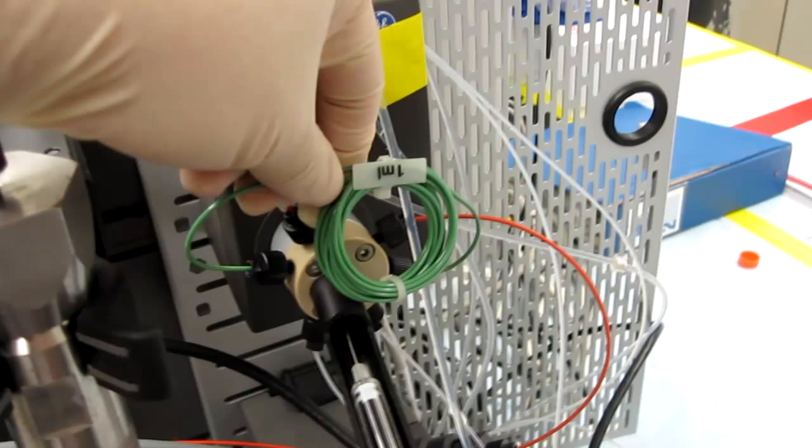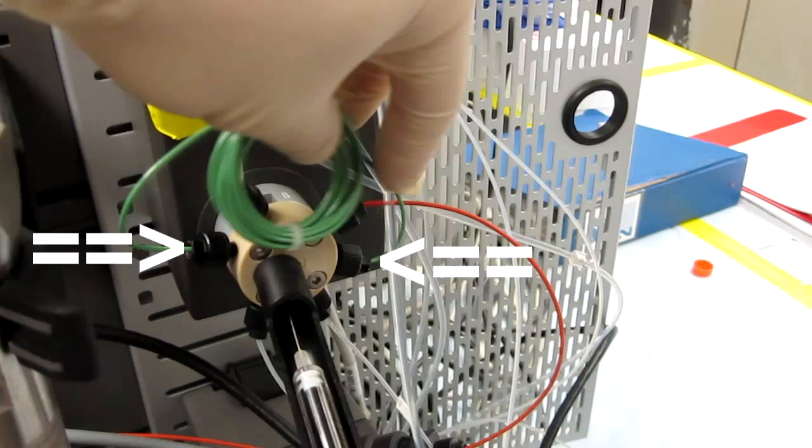The sample loop can also be switched out to the desired volume. In this case, the 1 mil sample loop is attached and can be changed out by unscrewing the plastic screws on either side.